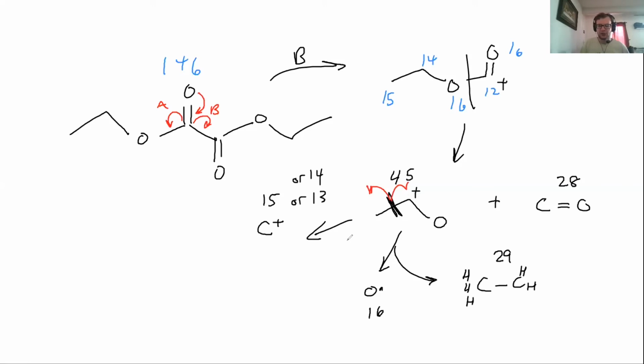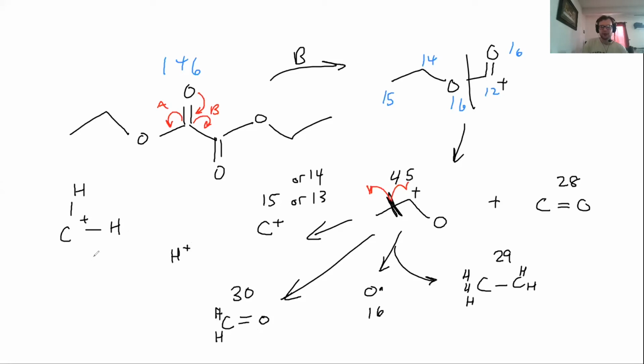And what we'll be left with there is a carbon attached to hydrogen, or a carbon attached to oxygen with 2 hydrogens there. So that's how we'll get the 30. Now let's say we may have some stray hydrogens running around here, and if you remember from organic chemistry, a secondary carbocation is not as stable as a tertiary carbocation.